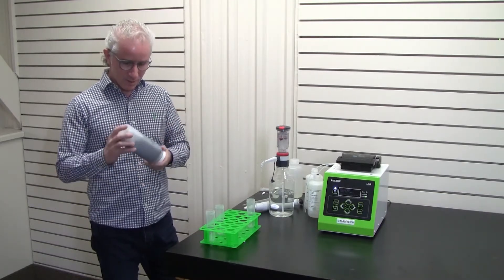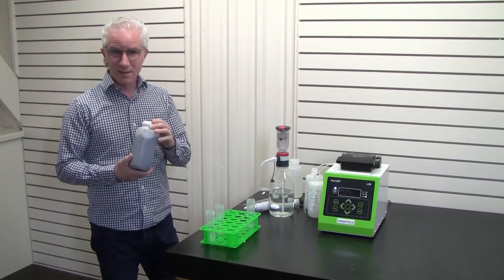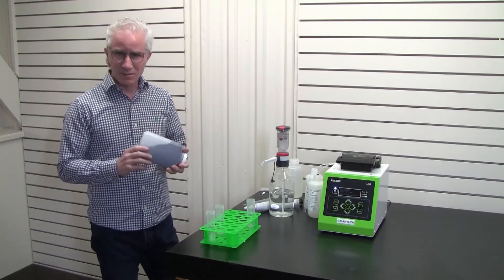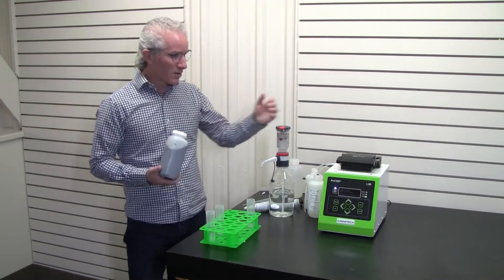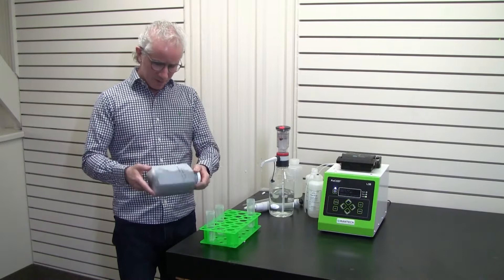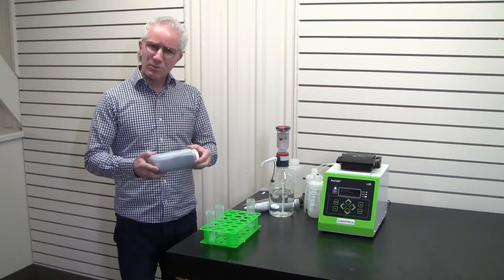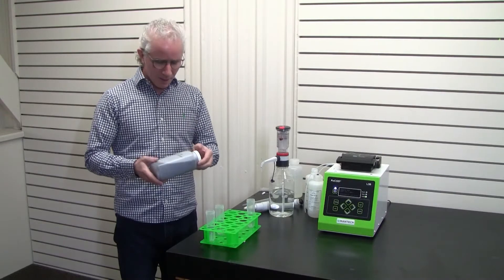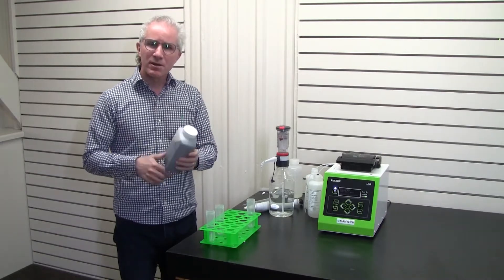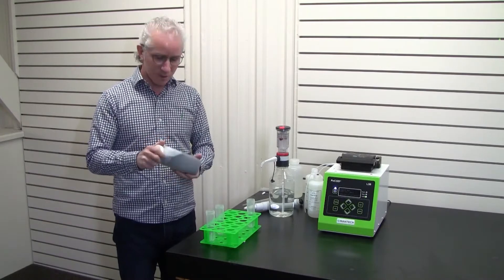We have a dirty wastewater sample. We're expecting particles greater than 50.0 microns that could clog the microfluidics inside the Peacock, so we'll do a pre-filtration step. It's dirty, so we suspect it could be high in BOD or COD, so we also want to do a pre-dilution step.